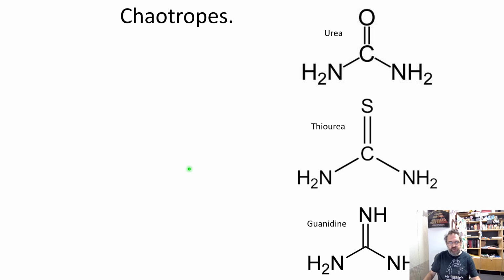The other way to do this is to use things like chaotropes, and chaotropes have kind of fallen out of fashion a little bit with the focus more on shotgun peptide-centric proteomics. There are still a lot of people who use these to do extraction for shotgun work, but they're mainly found in two-dimensional gel electrophoresis, where you're doing isoelectric focusing before you do size separation.